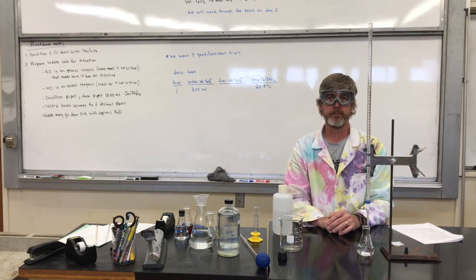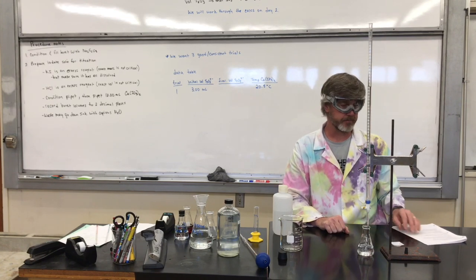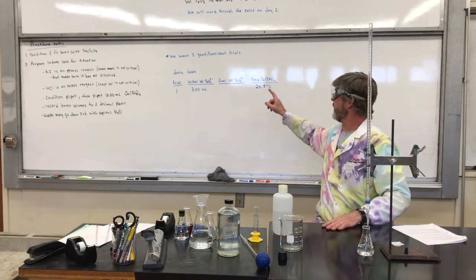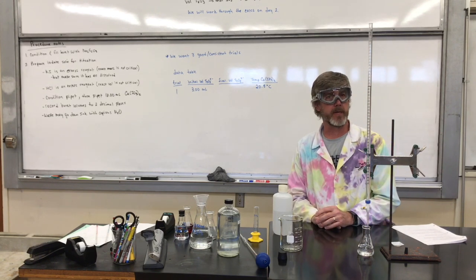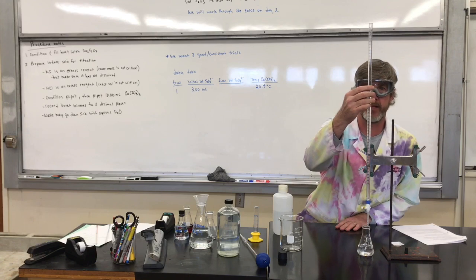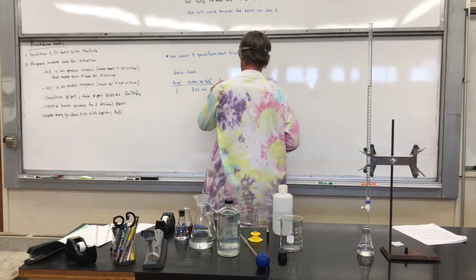There we are. So that one probably went just a hair too far. What we're going to try to do is get to where we get 3 good, consistent trials. So that now puts me in the ballpark, and this turns out to be about 17.03 milliliters.